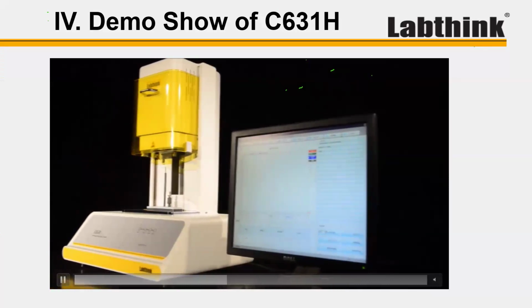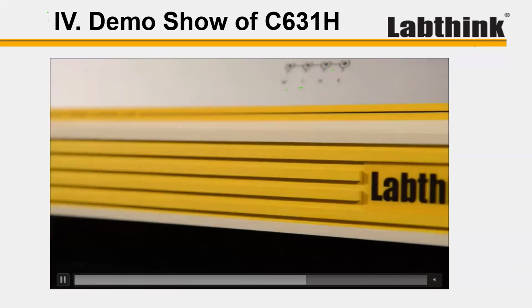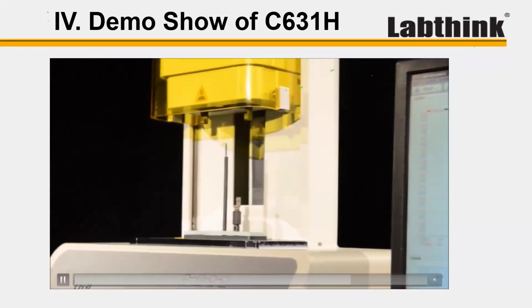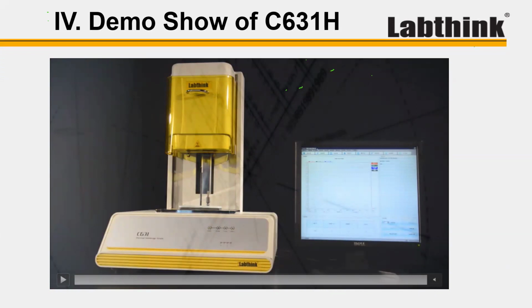And you can see there the attachment to the computer monitor. So that just gives you an overview of what it actually looks like. You can see the clamping pieces there. You can see the thermocouple, you can see the status indicator lights, and so on. That gives you an idea of what it would look like in your laboratory.